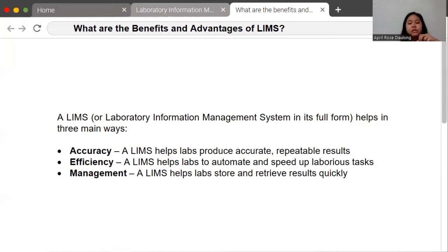So the laboratory information management can offer powerful features that enable labs to maintain data compliance and audit trails. So the LIMS captures data automatically, gets processed and stored for future references.